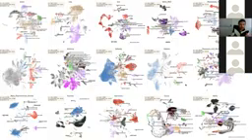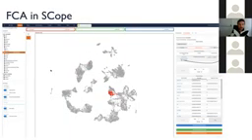So the way that we analyzed this was using a pipeline that is available in GitHub called VIB-singlecell-NF, or VSN, that allows us to automatically analyze each tissue in a reproducible fashion. It runs Scanpy as well as SCENIC, and generates Loom files that can be opened in our viewer called Scope. And in this viewer, we used annotation jamborees with experts in the field to annotate each cell type. This is now the result of those jamborees, where for each tissue, experts went into Scope and annotated each cell type with an ontology, the anatomy ontology. So these have IDs that can be linked in a tree of the anatomy. As you can see, a large part of the tissues could be annotated, and some parts that are gray are unknown and could not yet be annotated. So this is an example in Scope.